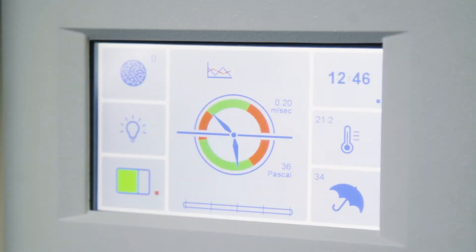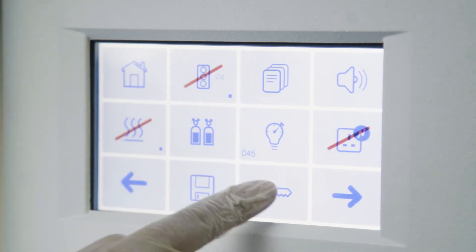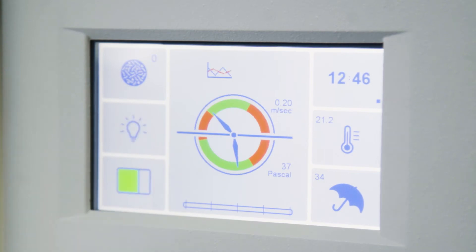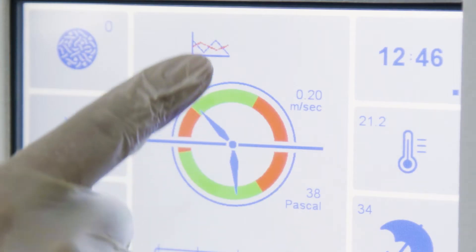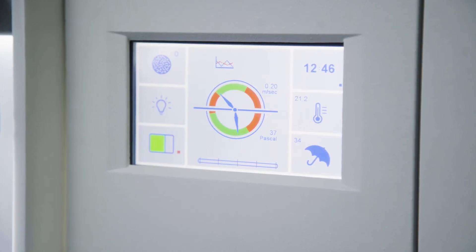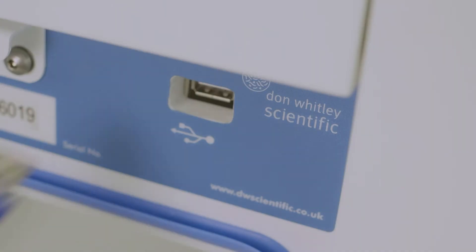Sterile air downflow speeds and all essential operating parameters are displayed in real time on the workstation touch screen. The screen is PIN code protected and allows users to control the airlock, access the event and data logs, and control the oxygen level. The data and event logs are fully downloadable in a non-changeable format, facilitating batch traceability.